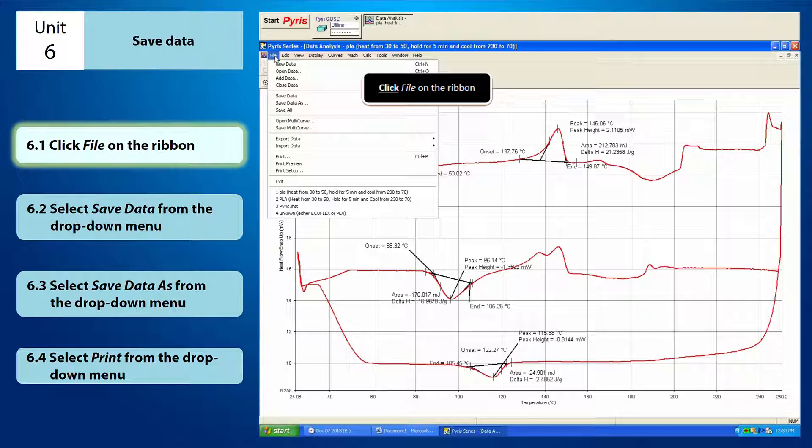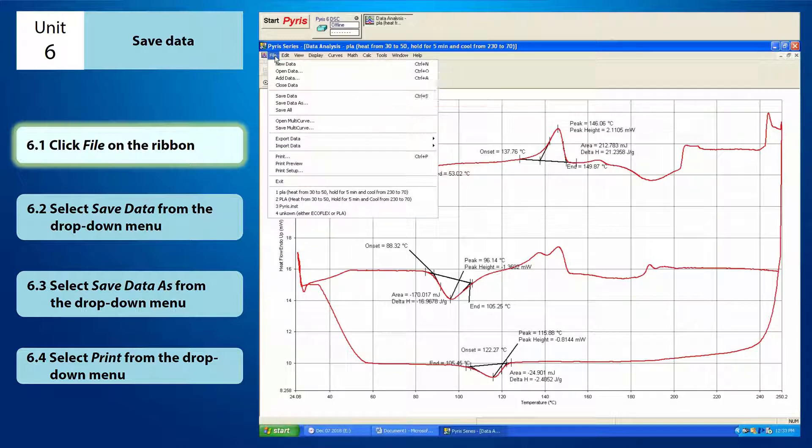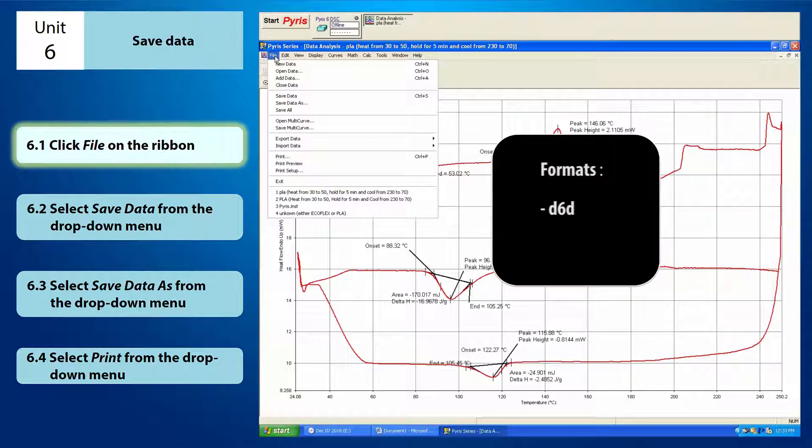You have to decide in what format you want the data to be saved in. There are two options here. First, D6D format.